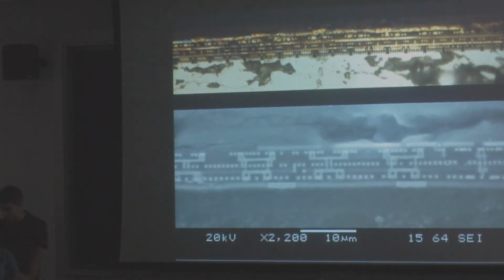Okay, well, like Jeff said in the last slide, a lot of the structures that we saw under both optical and SEM were kind of just jaw-dropping.